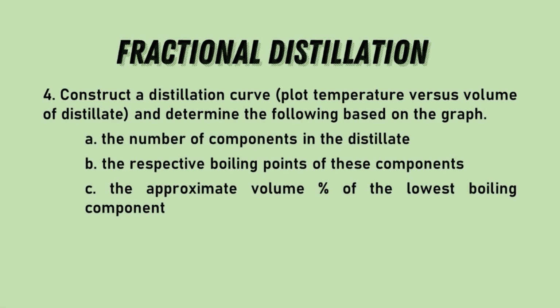Fourth, construct a distillation curve. Plot temperature versus volume of distillate and determine the following based on the graph. A. The number of components in the distillate. B. The respective boiling points of these components. C. The approximate volume percent of the lowest boiling component.